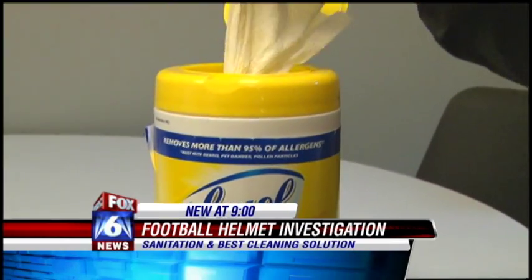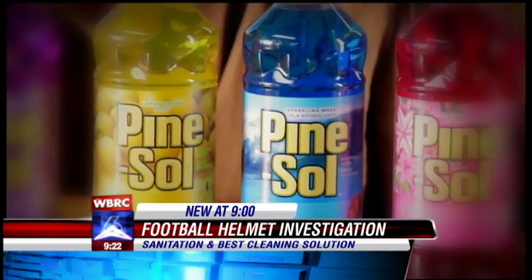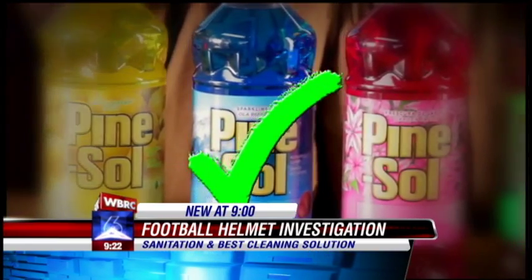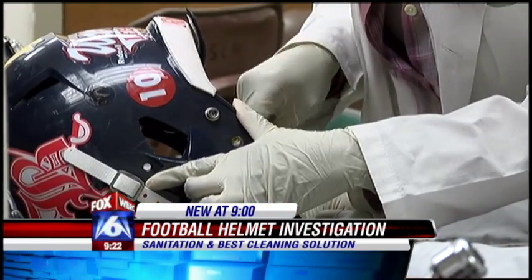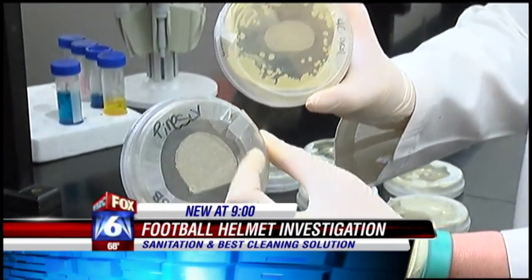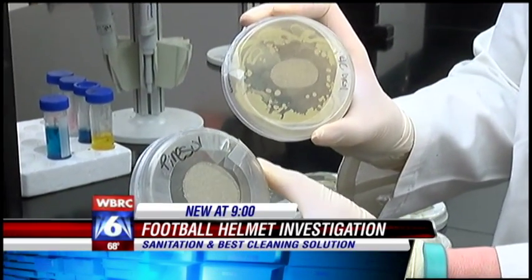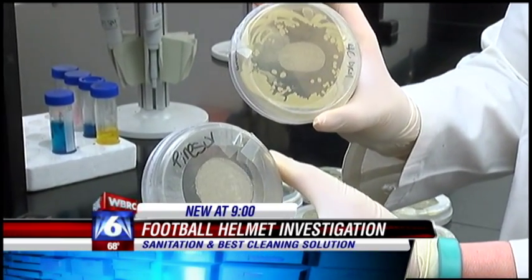Now the Lysol, on the other hand, killed a significant amount of bacteria. But it was the Pine Sol that took the win. Pine Sol was the only cleaner to kill the majority of bacteria on every helmet tested. Lysol was pretty effective, but if you compare it to the Pine Sol plate, there's no growth on this plate at all. It killed all of it — it was very, very effective at killing the bacteria on the plate.